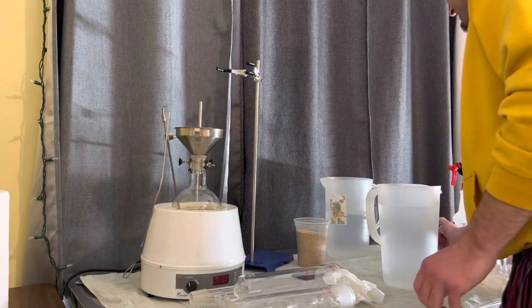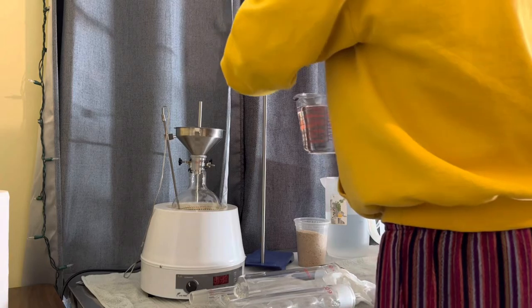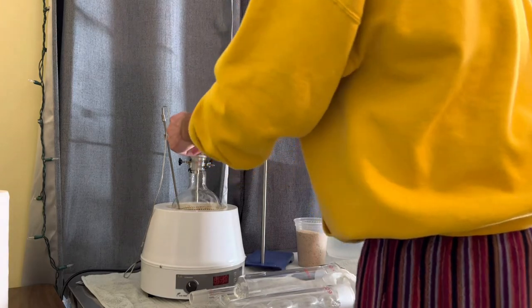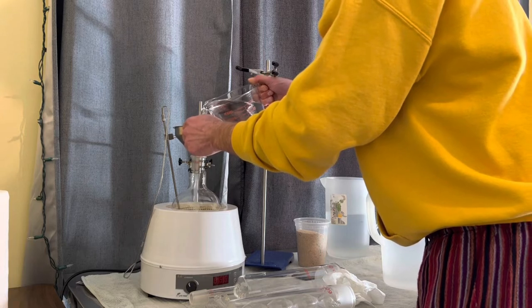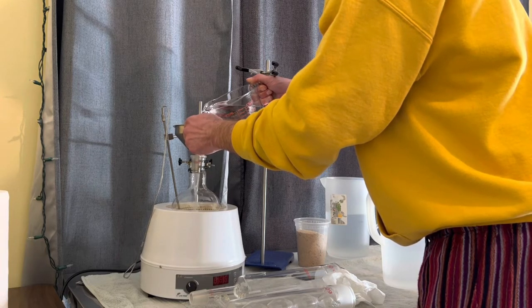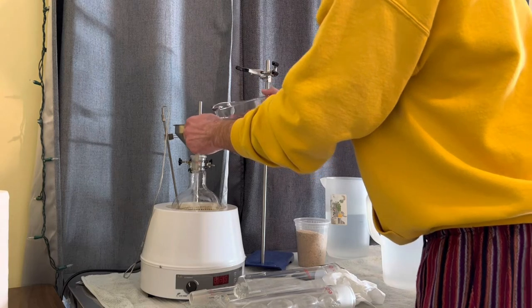Then we take our solvent of choice, Extractahol. They have 190 proof and 200 proof ethyl alcohol. This is all I use. This is all I've ever used.